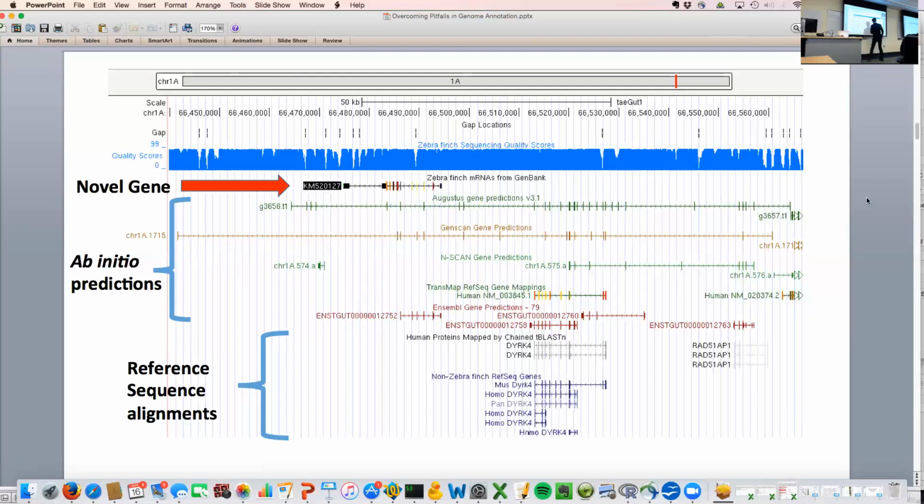There are lots of other ones where, if you look at an actual alignment of genes from other species, because all of these alignments are going to the same place, that gives you more confidence that this is the actual structure of the gene. A lot of these models are partial models, where they don't pick up all the exons. In fact, sometimes they incorporate exons into other genes where that's not the structure at all.